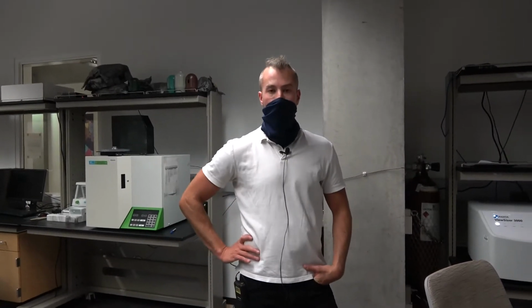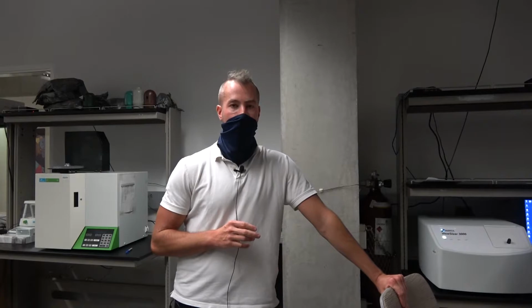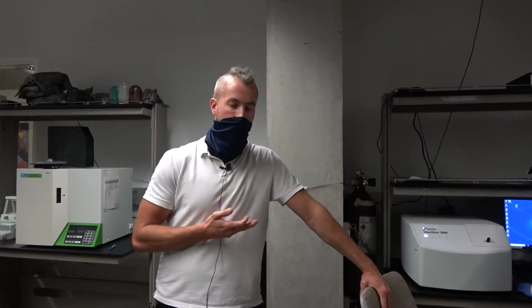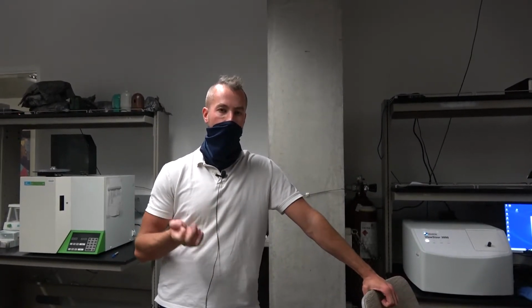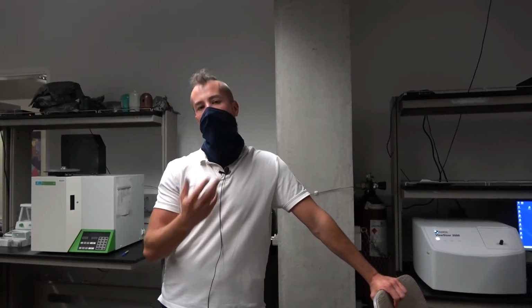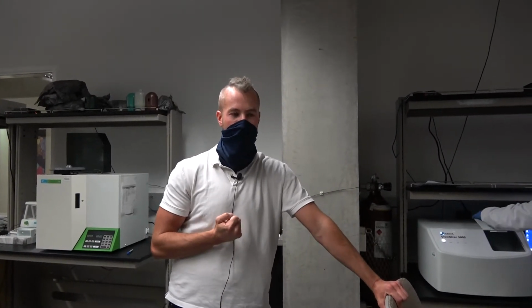Okay, so we're now in the basement of the SME building, and so this is yet another one of those pieces of equipment that I just really hate that you guys can't use. This came online about 2 years ago, and so this instrument is called the MANTA. I mentioned it at the introduction of the Day 2 section, so multi-wavelength nanoparticle tracking analysis. So it's kind of like dynamic light scattering, and it's kind of like dark field microscopy.